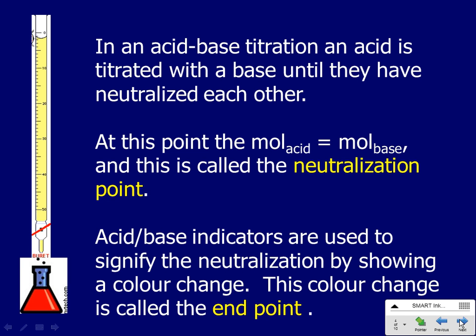Now, in a moment, I'm going to set up the equipment. I'm going to show you how we do a titration, and we'll write some numbers down, and we'll gather some numbers up, and then we'll do some calculations. Tomorrow, you're going to do a titration where you're going to standardize some sodium hydroxide. So we're going to have some sodium hydroxide that we don't know the concentration to very well, and you're going to do a procedure so that you can learn the concentration and calculate the concentration very well. That's day one of our lab.